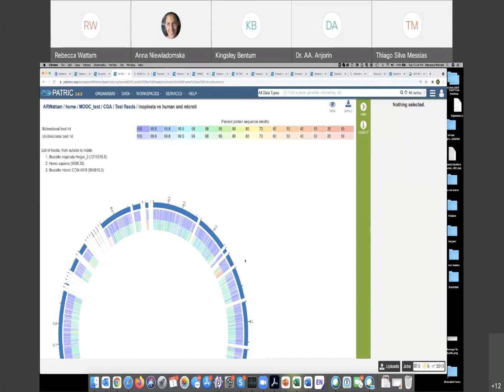Part of the bacterial bioinformatics class goes over this because this is an awesome tool, especially the Excel sheet that comes with it. It's just beautiful. But you could also look at the tutorials. So that would be the way I could do it.